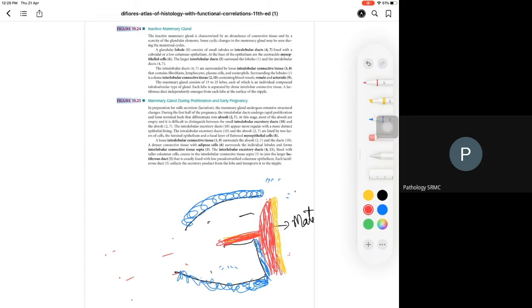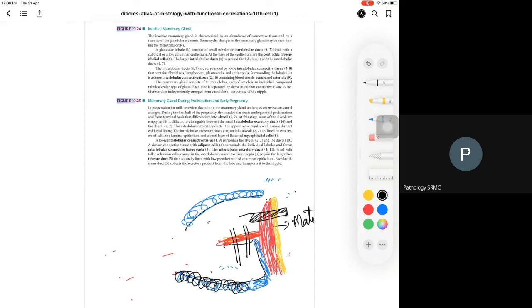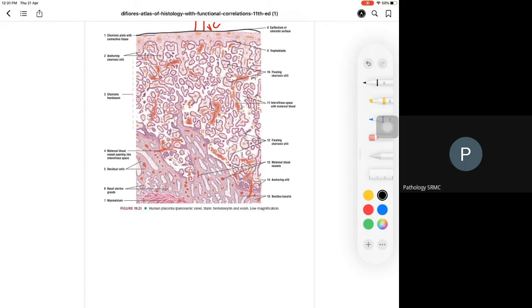Other than the part of the baby, this is the umbilical cord, maternal and fetal surface, maternal surface, the umbilical cord and membranes. When you are grossing the membranes, you take a section and give a roll; you give two sections. Grossly you see there are three blood vessels - that is very important to identify grossly, because sometimes there will be only two vessels. For the placental parenchyma, give a section so you can see the fetal surface, placental parenchyma, and the maternal surface. You measure the length of the cord, then cut the cord and the membranes, and measure the weight of the placental parenchyma without cord and membrane.